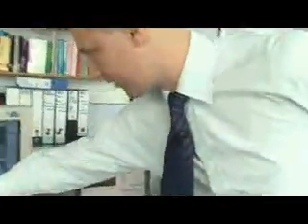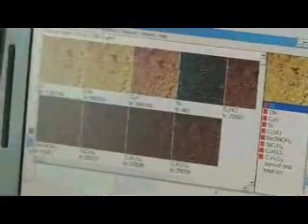But what this does then eventually is it gives us a spectrum. And you can see a spectrum that's coming out here. Basically each little peak corresponds to a particular type of material on the surface. And we can take that information and then map that on a surface and say what material is where. And that's critical in understanding how, for example, coatings of implants interact with our body.